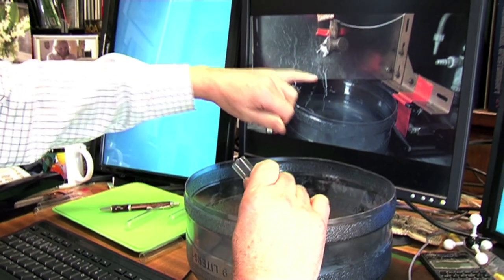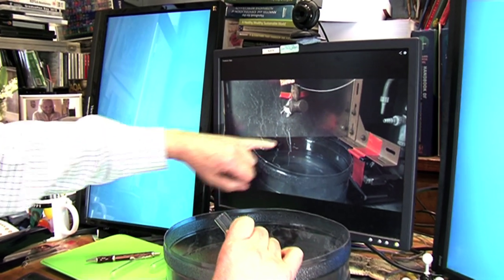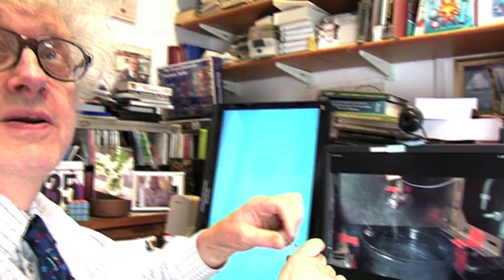And you can see it is hitting the water just about there, and there are some tiny pieces of rubidium coming down here with white smoke trails, because it's reacting with the water vapour in the air.